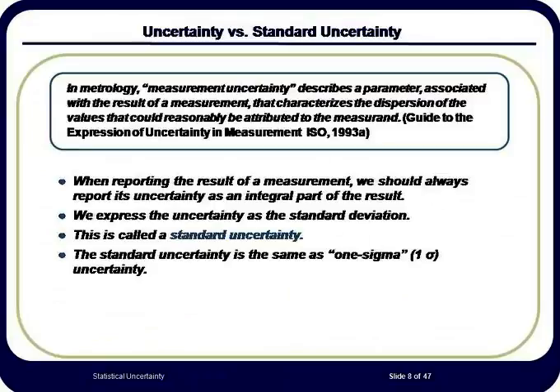So let's go back to our example and say the value is 25 plus or minus 350 picocuries per liter, where we have reported the 1 sigma uncertainty. The meaning of this value is much clearer. This is not a value that can tell us how close to the drinking water limit of 20 picocuries per liter the sample actually is. In contrast, if the reported result was 25 plus or minus 1.2 picocuries per liter at 1 sigma uncertainty, we could have a good deal of confidence that this sample has exceeded the 20 picocuries per liter limit.